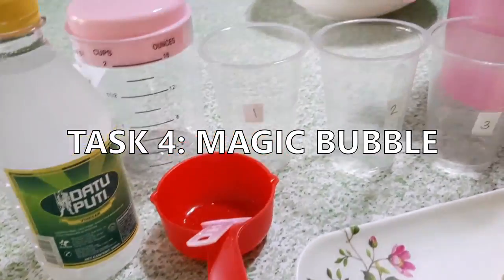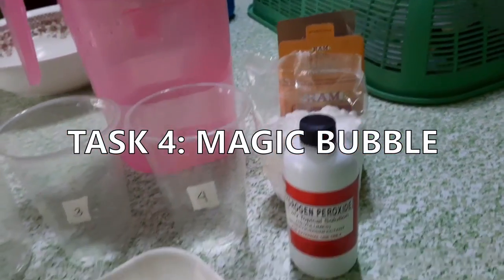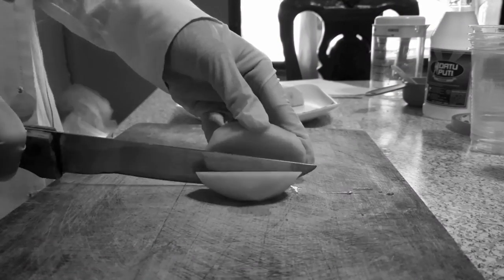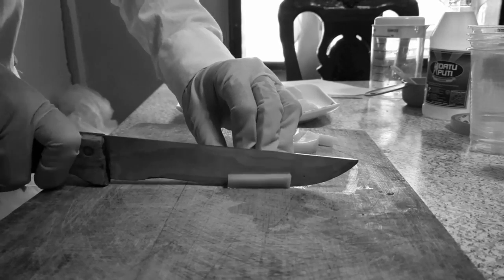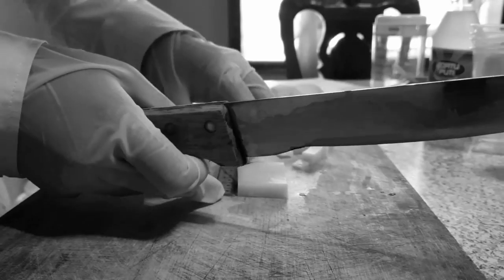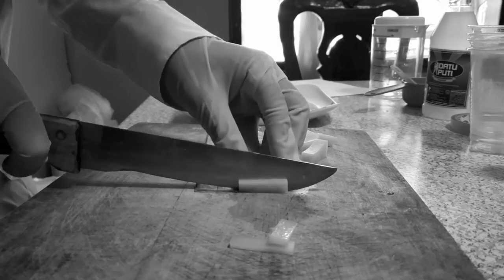Hi guys, I'm glad you have arrived with the fourth task entitled Magic Bubble, and these are the materials for the experiment. For the potatoes, it was sliced beforehand. I also used a ruler to ensure that the potato strip dimensions were consistent.